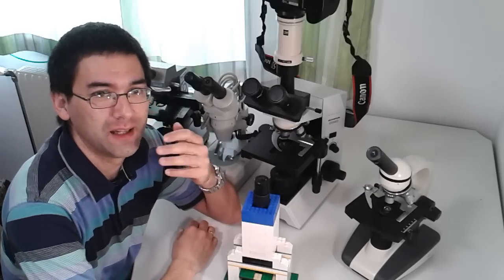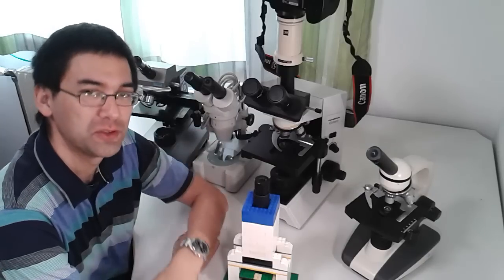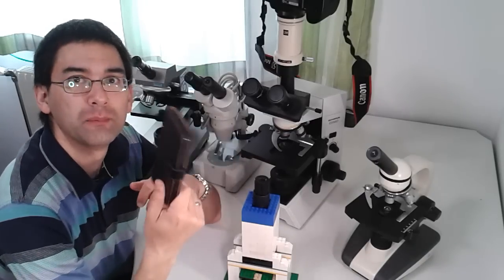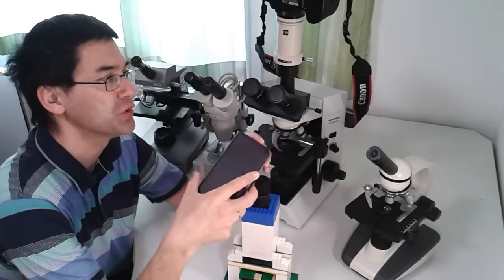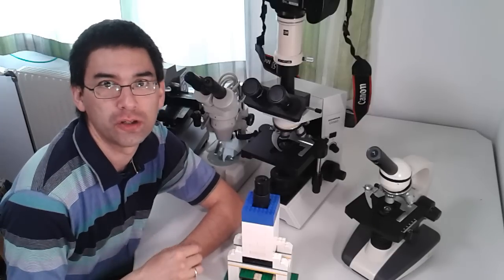I own five microscopes and I want to show them to you and compare them. Later on I'm going to use my mobile phone to take pictures through the eyepiece and let's see how good they actually are.